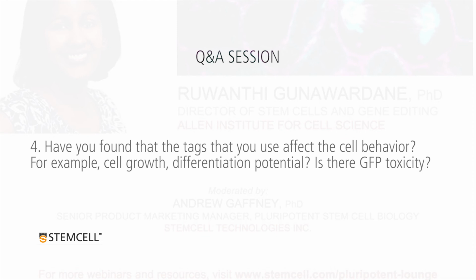But in general, the two final clones we pick, we do not see any observable effect. That does not mean that if we did a functional assay, for example, with the microtubule line, if we do a certain dynamic assay, that we wouldn't see a difference. We really do think a GFP putting a tag in there has to be somewhat perturbing. We just haven't seen it.